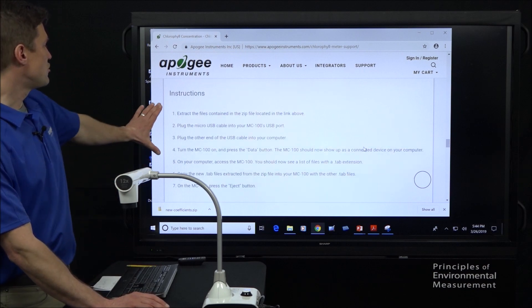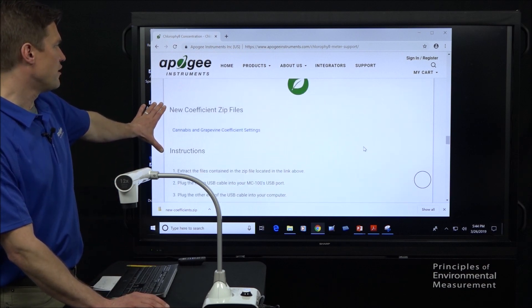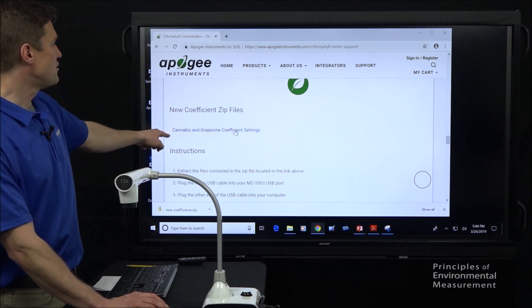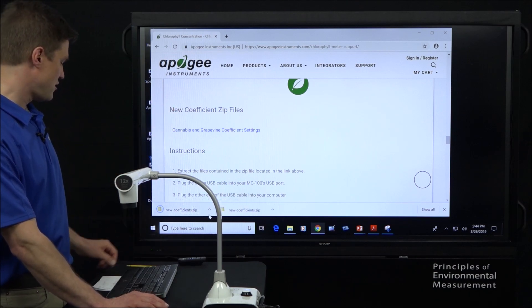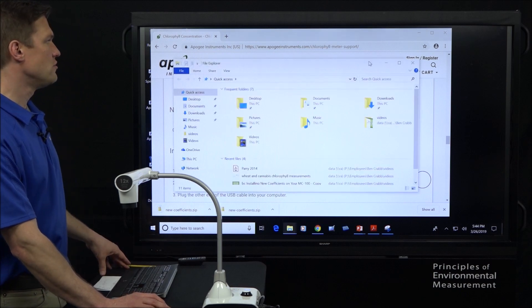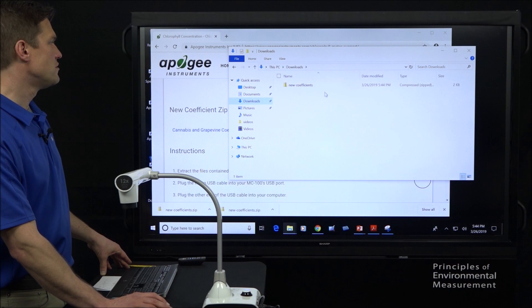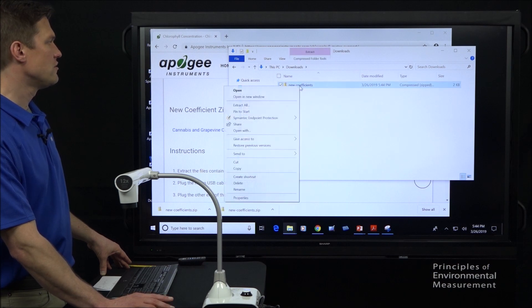We have a link here. We also have instructions here that you can follow in case my video doesn't suffice. But you can download the new coefficients right here. Now let's open up a new explorer window. We can go to our downloads. Here's the new coefficients it just downloaded.